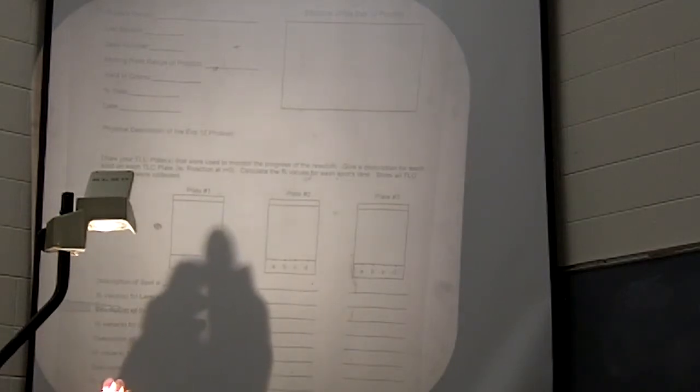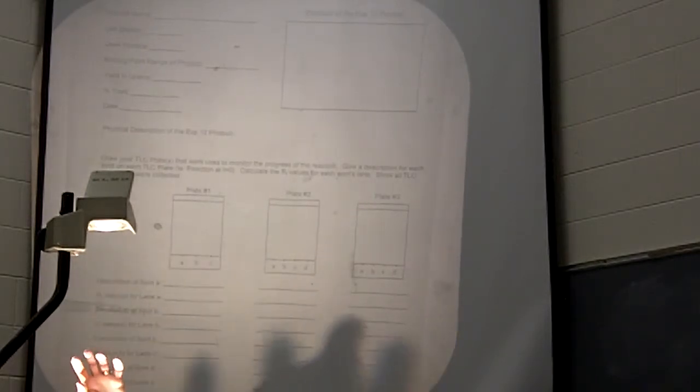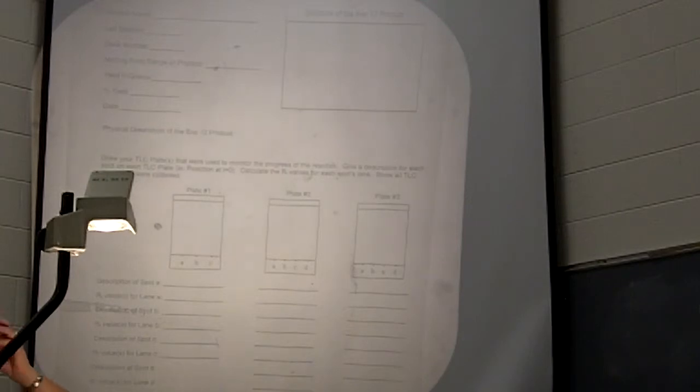Or you will be taping them into your lab notebook vertically and keeping them that way. Each lab prof has their own preference, so find out what they want. Either draw it vertically or tape it vertically, because again you look at it up and down.